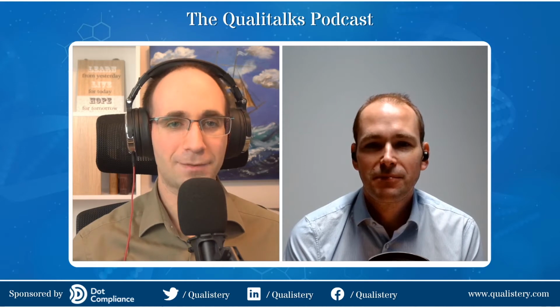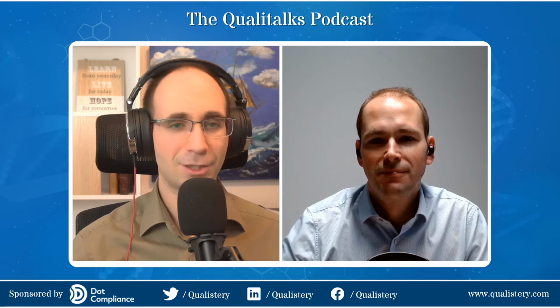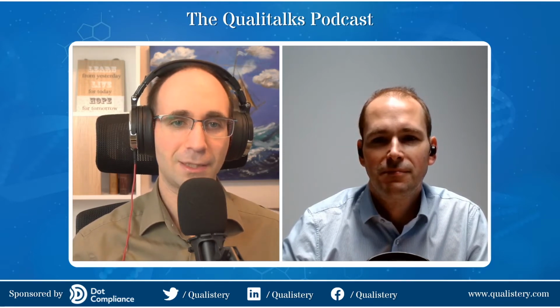So today we want to talk about autoclaves, their purpose in the pharmaceutical industry, and how to choose them, how to do the right and correct validation and qualification of the equipment, how to choose the vendors. So it's quite an interesting topic around it. So what is your expertise in the field?